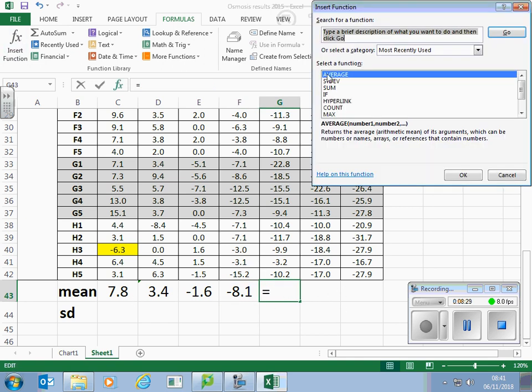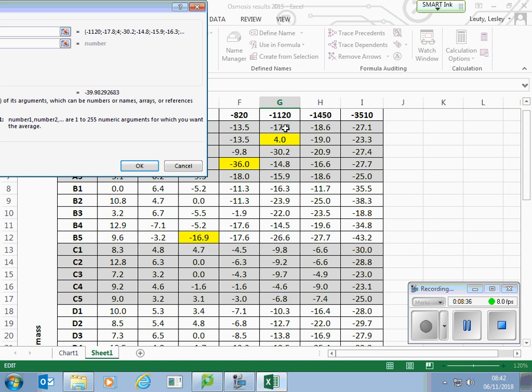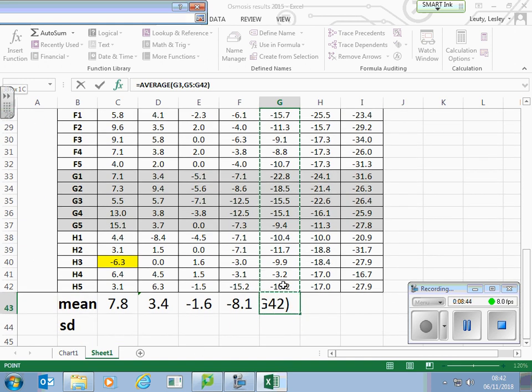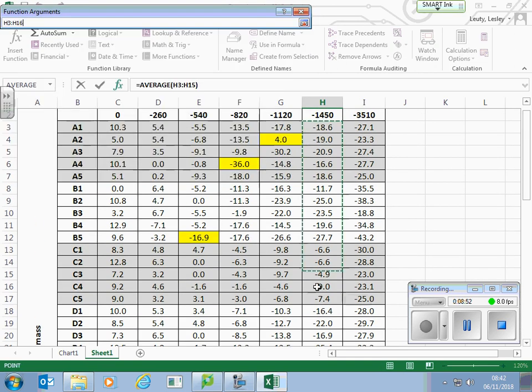Again, hit Average, OK. Let's move that over the other side. I think we're on this one, aren't we? That one. Then hit Control, go the other side. Okay. Next one, easy because we haven't got any anomalies in this one, so we just scroll down.